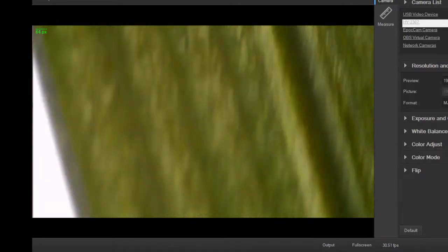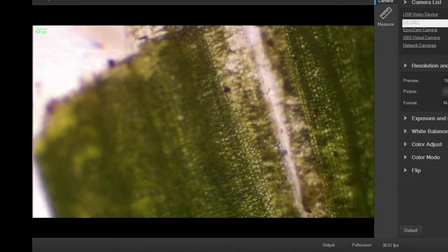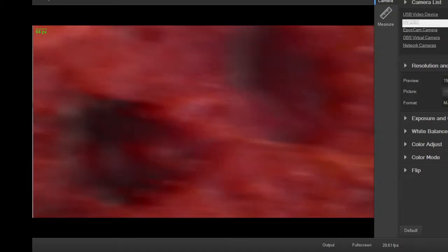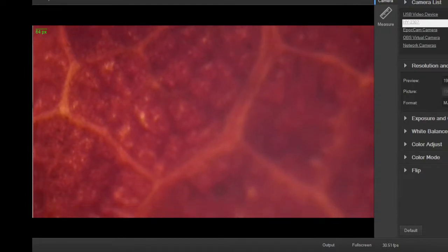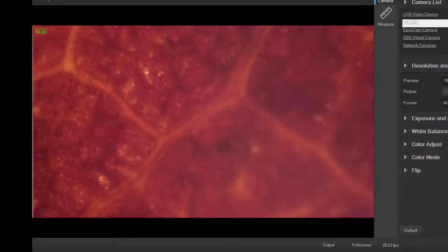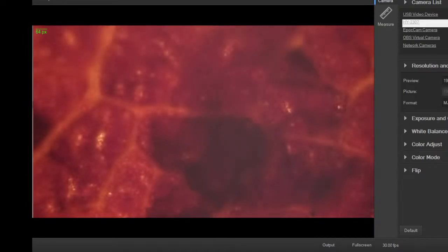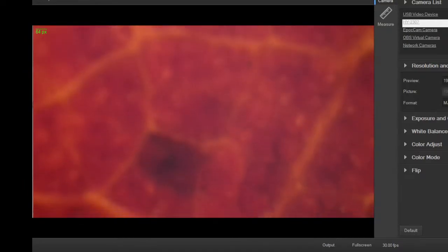Let's go back to a lower power and see what's what. A leaf that I picked from the leaf debris. You see it's already starting to grow. Some nice venation there in the leaves. But it's already starting to get some spots where the fungi are eating away at it. Fungi and bacteria going to town on the leaf, but nice color there.